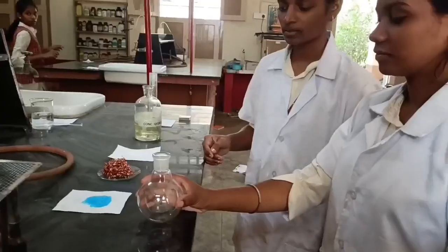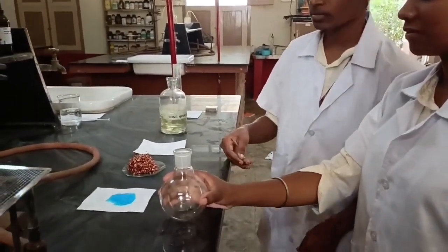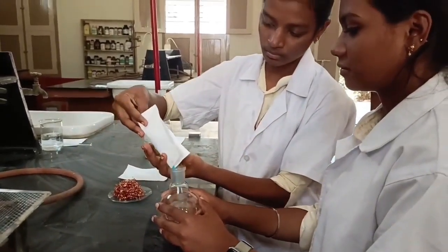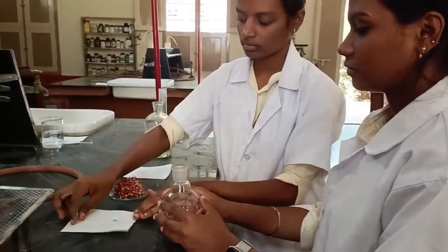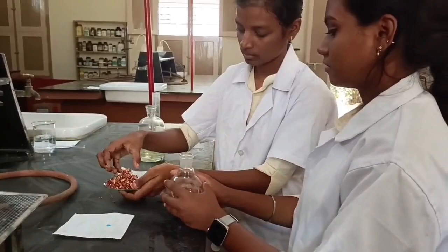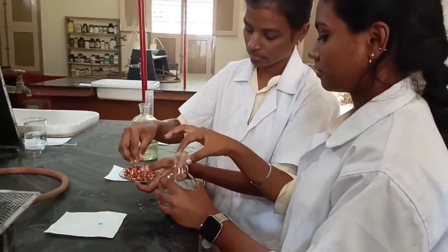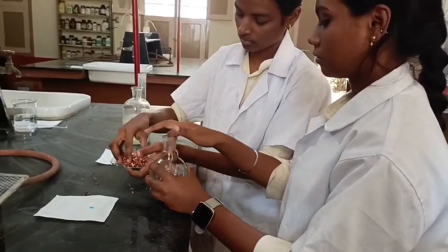Now we are adding all these chemicals into the round bottom flask. Firstly, we are adding copper sulfate into the RBF slowly. After that we are adding copper turnings. Copper turnings are very light in weight here; in many bottles you can observe thick pieces of copper turnings also. So 6 grams of copper turnings are being added very slowly into the round bottom flask.